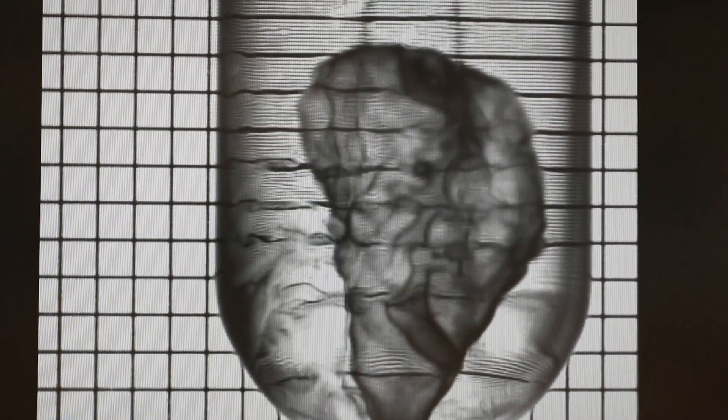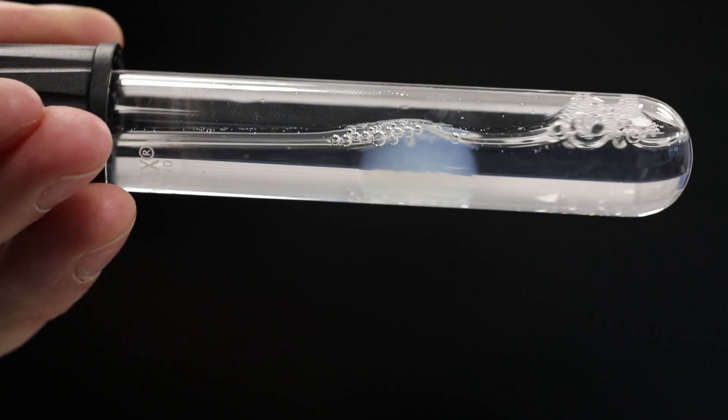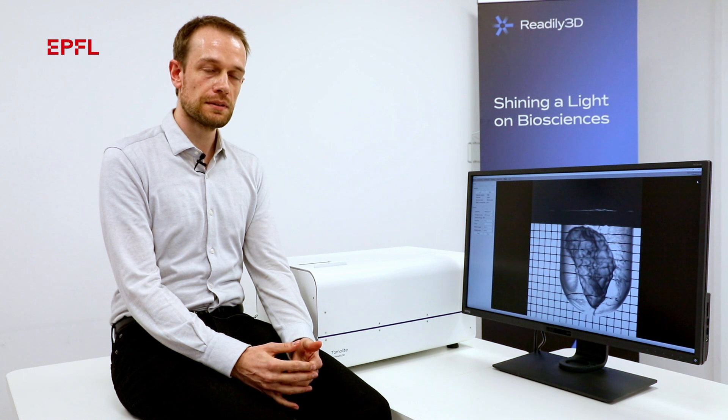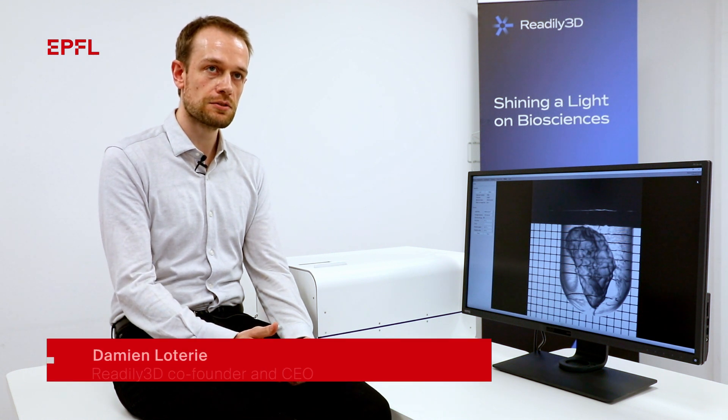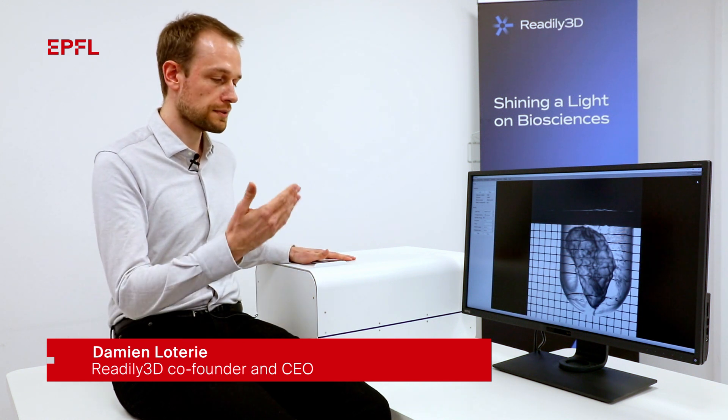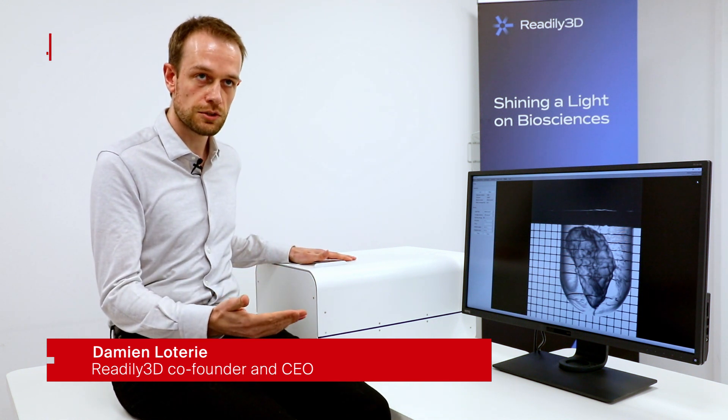The main objective of the ENLIGHT project is very ambitious and has never been attempted before. The purpose is to develop a functional model of the pancreas at a centimeter scale, derived from human pancreatic cells, to test medications for diabetes. Readly3D's tomographic printers can print centimeter-scale structures in just 30 seconds using light, and it is this combination of size, speed, and resolution that makes this technology particularly suitable for this project.